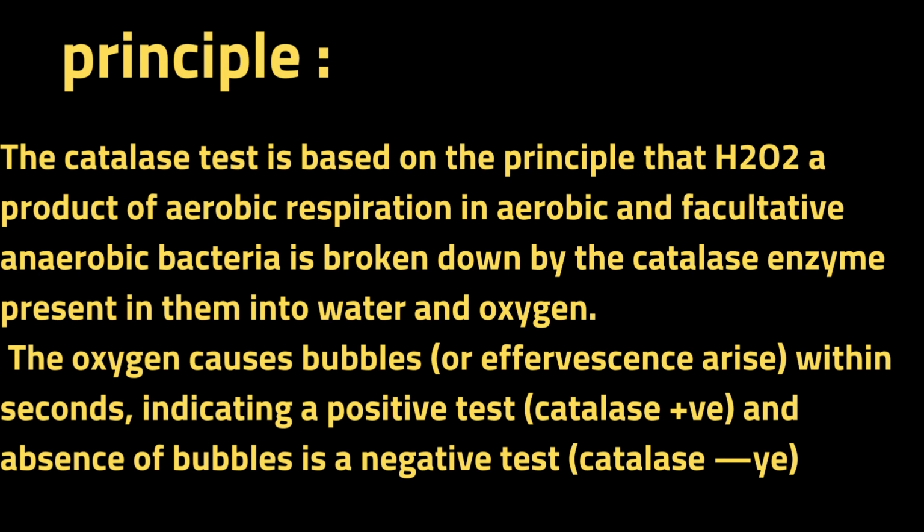Principle. The catalase test is based on the principle that hydrogen peroxide, a product of aerobic respiration in aerobic and facultative anaerobic bacteria, is broken down by the catalase enzyme present in them into water and oxygen. The oxygen causes bubbles or effervescence to arise within seconds, indicating a positive test, catalase positive, and absence of bubbles is a negative test, catalase negative.